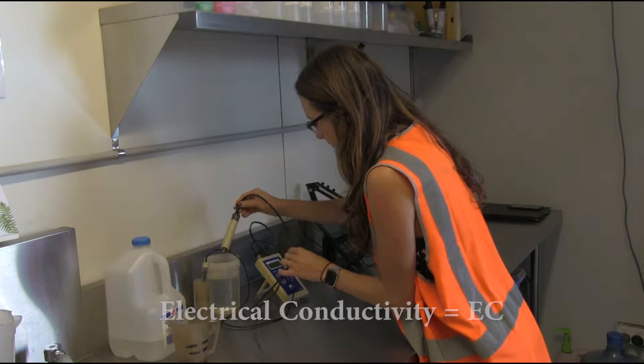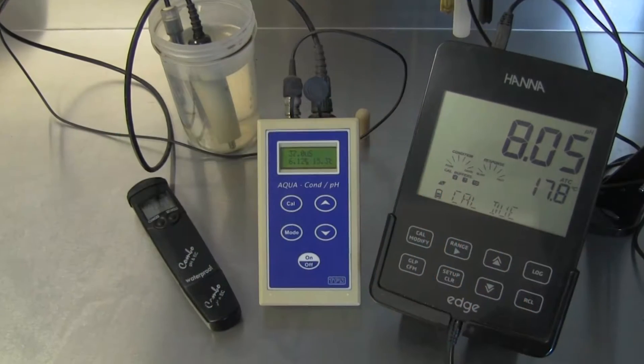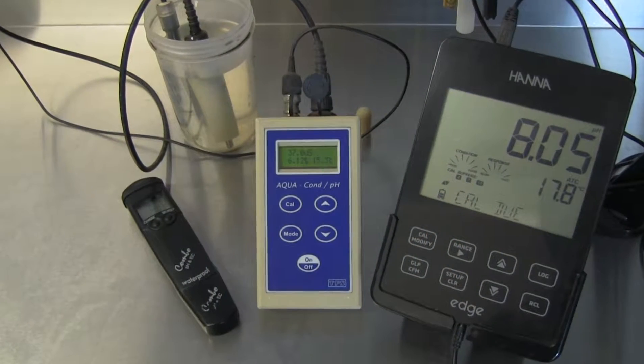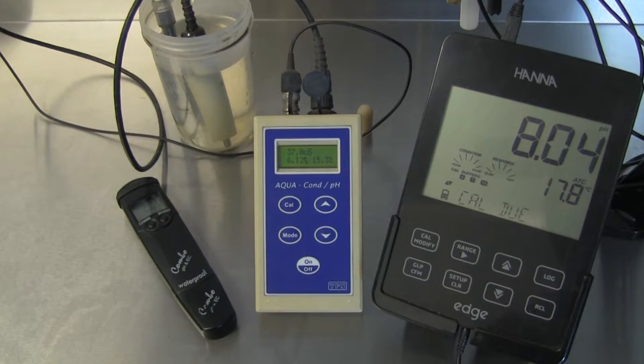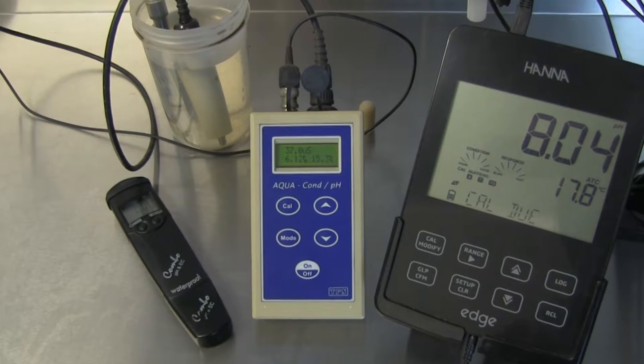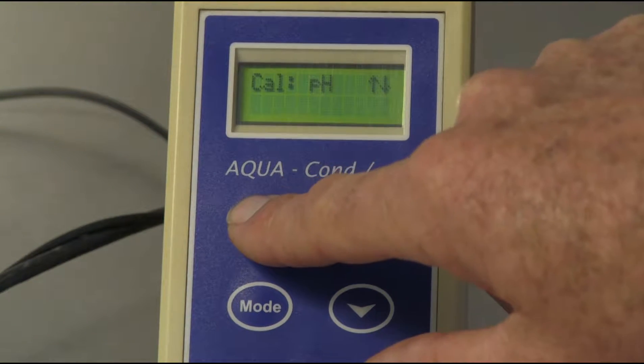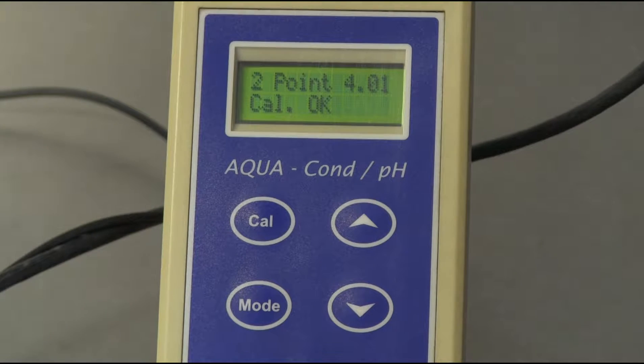pH and electrical conductivity meters are extremely useful pieces of equipment used to measure and monitor basic chemical characteristics of water and growing media. Regular and correct calibration of this equipment is necessary to ensure the results are as accurate as possible. The following video describes the basic procedures for calibrating pH and EC meters.